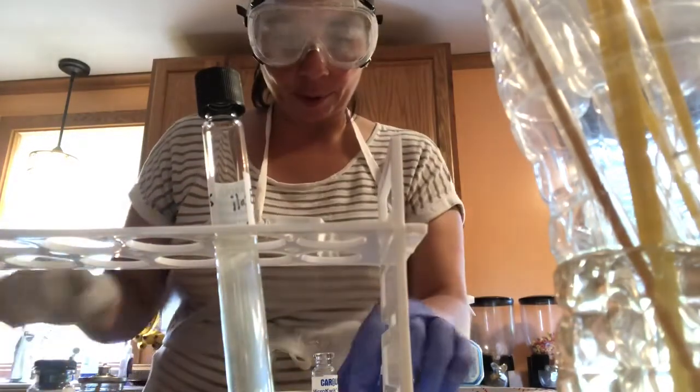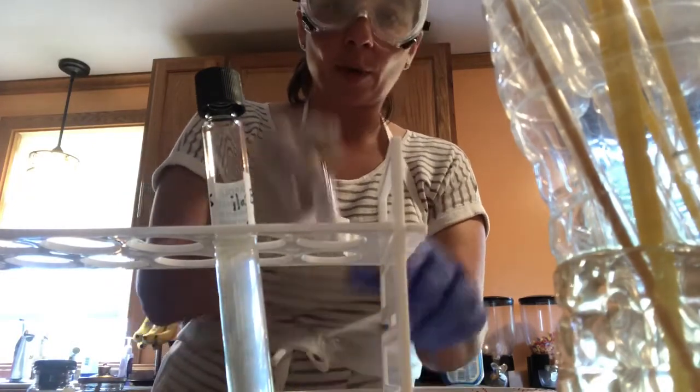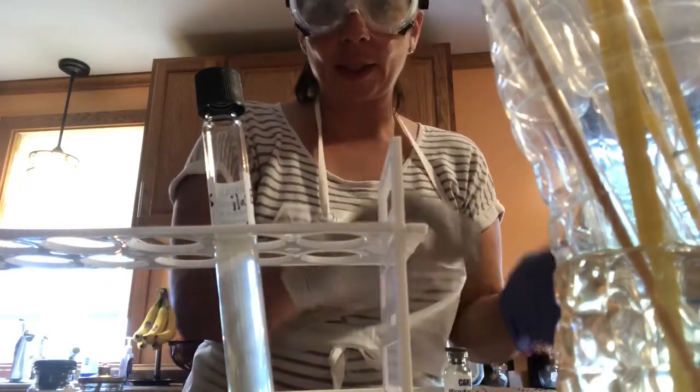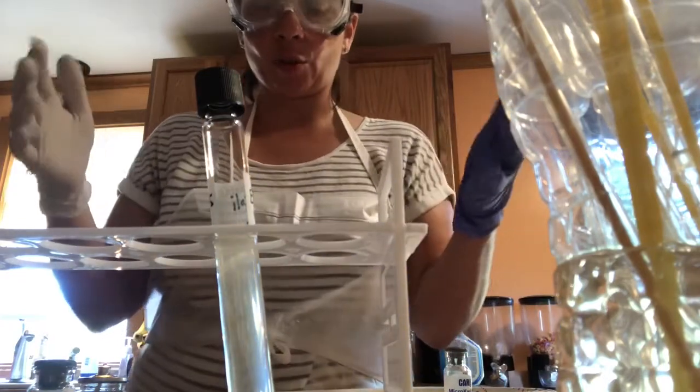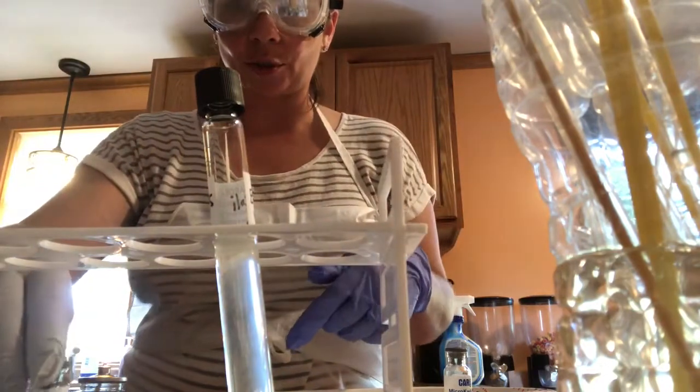Okay, notice I'm gonna put the stopper back in my bottle of freeze-dried bacteria. When I'm done, the phone is actually resting on the decontamination vessel. So I'm gonna separate the lid and the glass vial and put it in that 10% bleach solution.